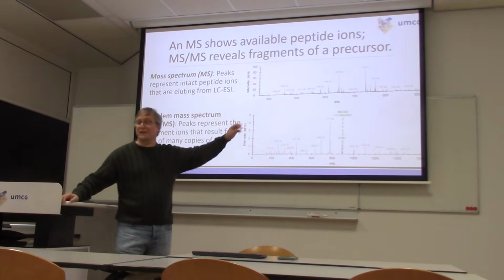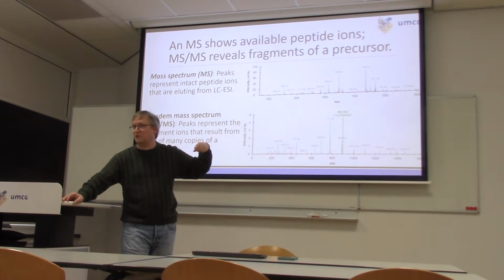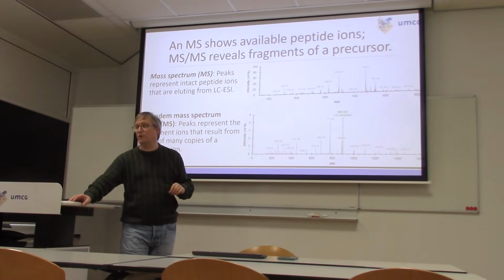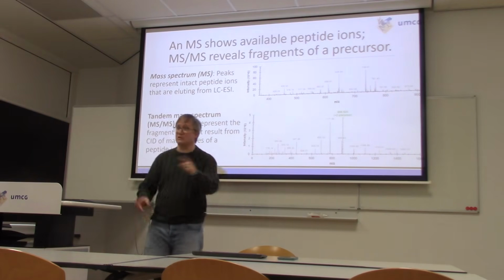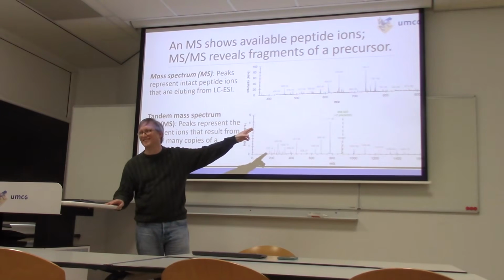So the instrument will collect one MS scan and from it collect a bunch of tandem mass spectra representing, say, the top 8 or the top 20 ions that it hasn't seen MS-MS for recently. This is called data-dependent acquisition, and it was the standard for how everybody did this for a long time. It's now losing sway to the technique we'll talk about at the end of this. But it's a lot easier to explain, so I'm starting here.